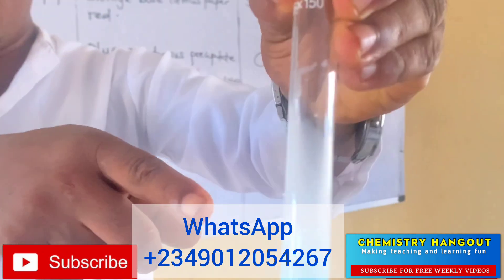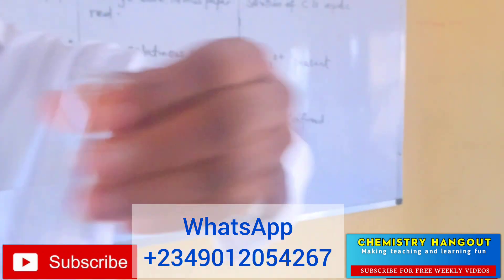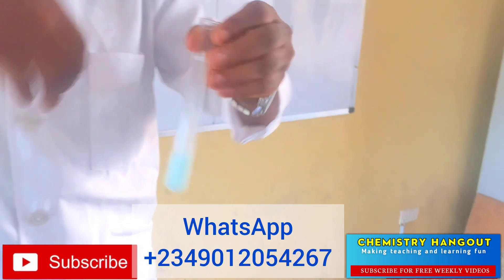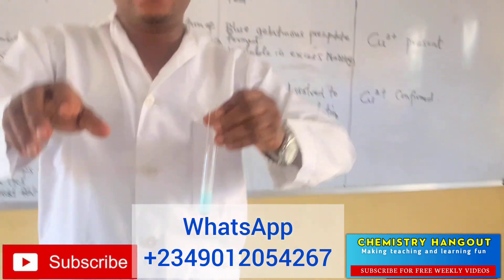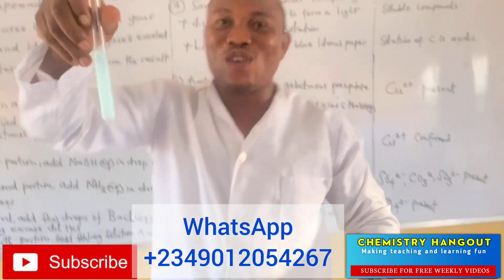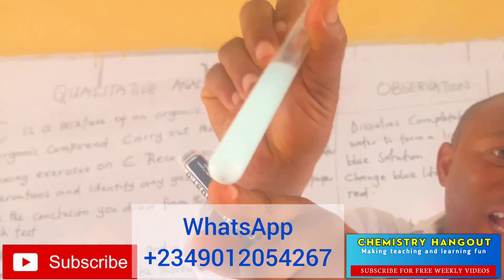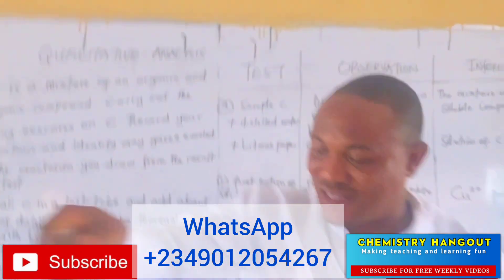Very, very important — did you see the color? Like you grinded chalk and put it in water. These things are practical. If you look at it, you'll be seeing a white like chalk inside.